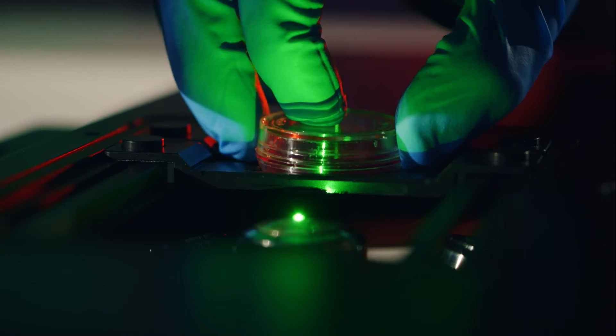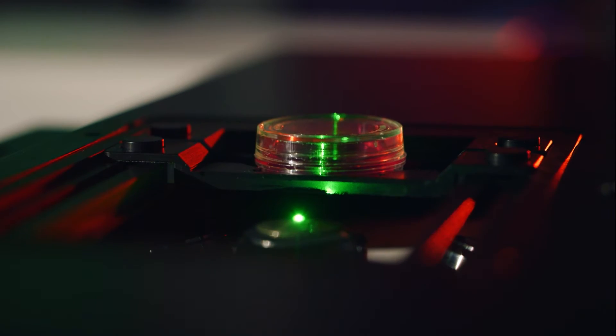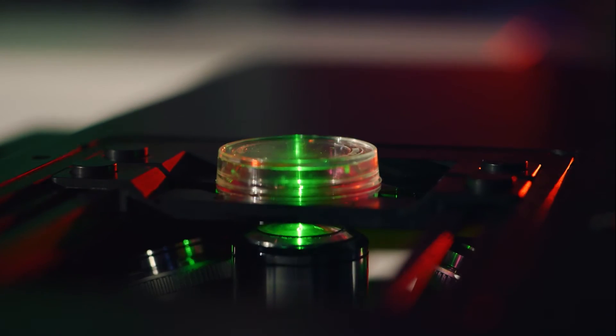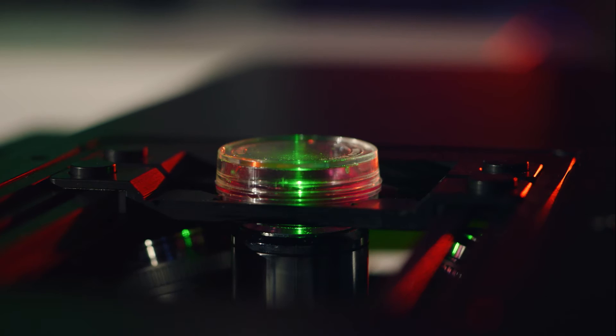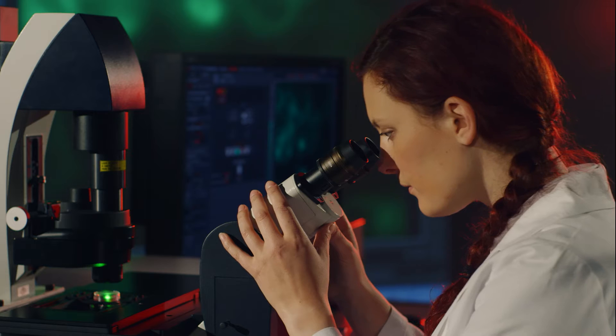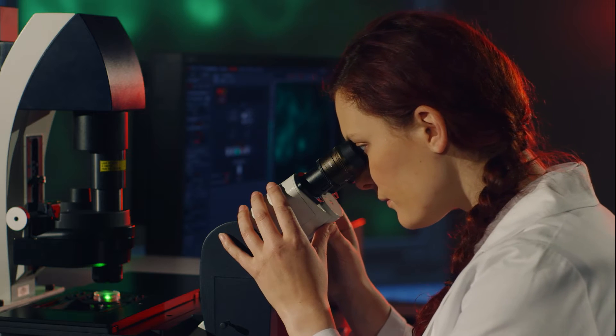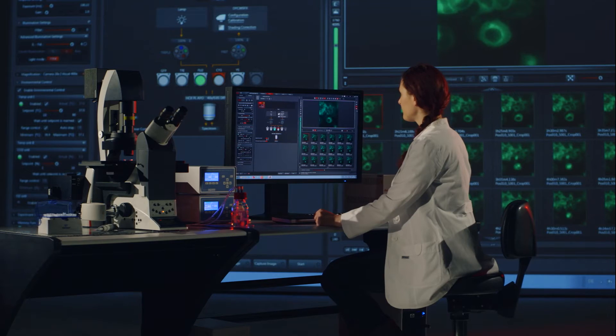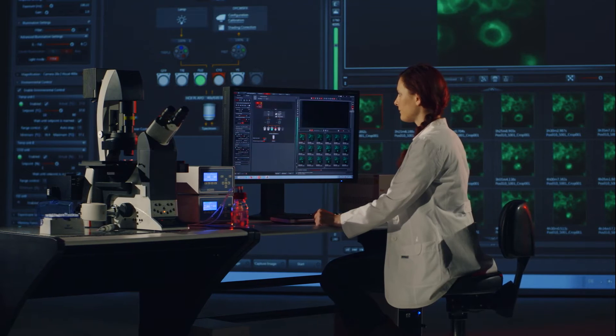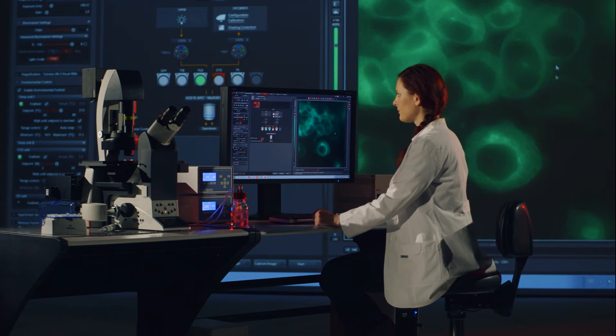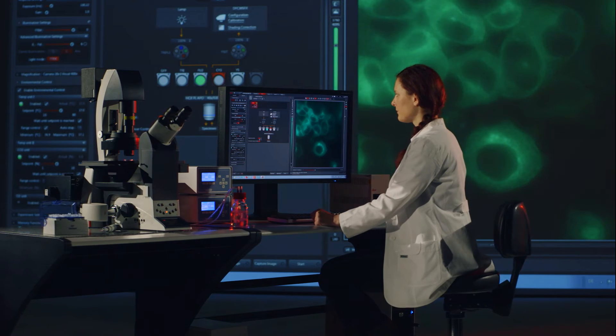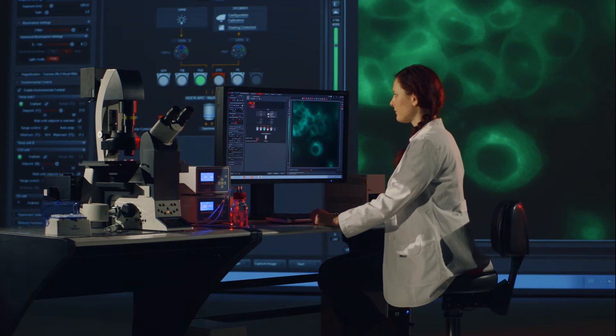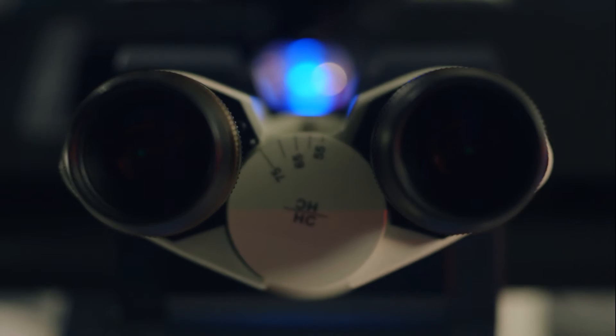Science comes first and ease of use is the key to excellent results. The Leica Application Suite X is the common software for Leica confocal, wide field and super resolution systems.